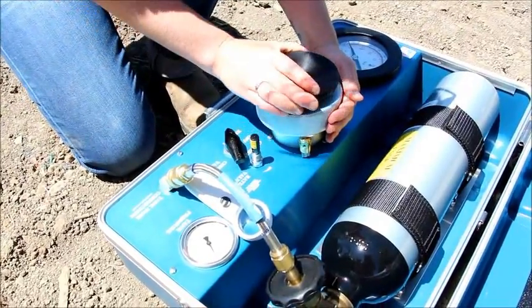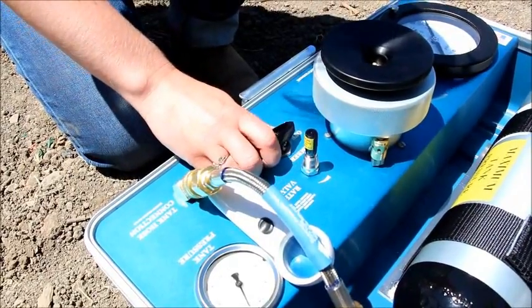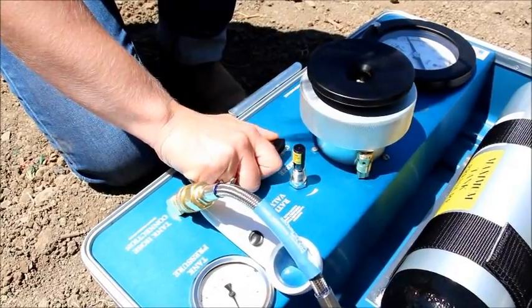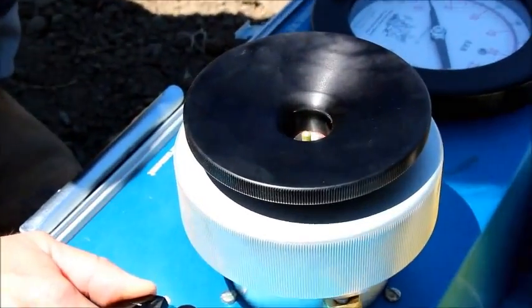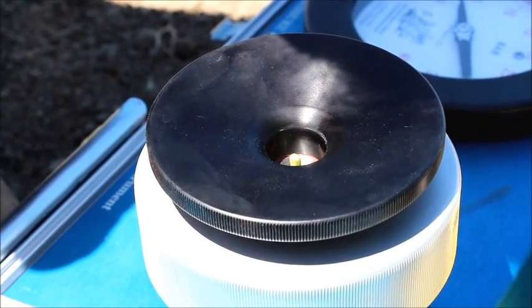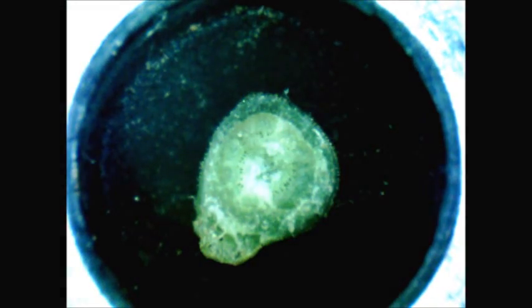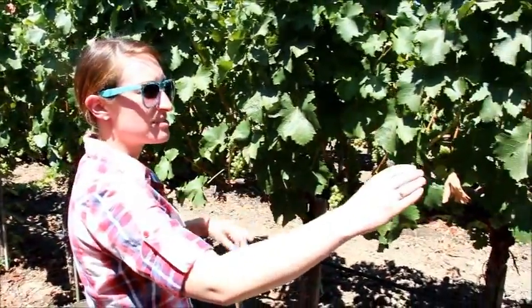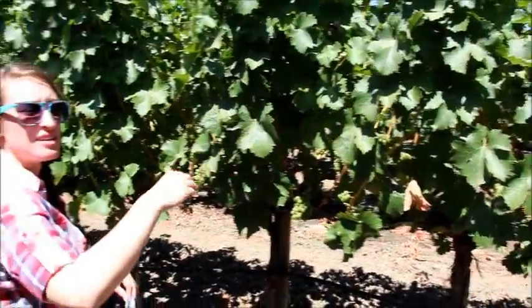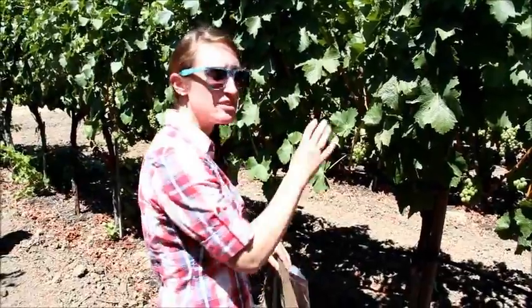We lock the chamber in the lock position. Then the control valve fills the chamber — the rate valve is set at one half bar per second — and we begin to increase the pressure, watching the end of the petiole to see the end point. We do five vines in a row with varying leaf heights — some in shade, some in sun — then five vines in another section, sometimes up to 20 vines in groupings of five, so that we're getting accurate readings throughout the whole block. It's more of a composite sample rather than just reading one vine or one leaf.